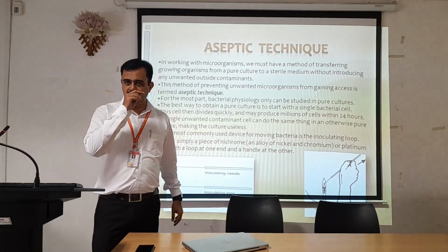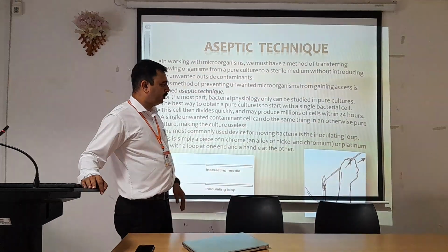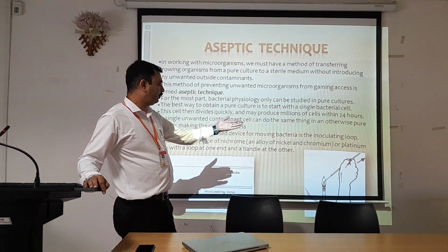Now, a question arises many times. Students always ask why this nichrome wire loop cannot be made of iron. It may also be of platinum wire.